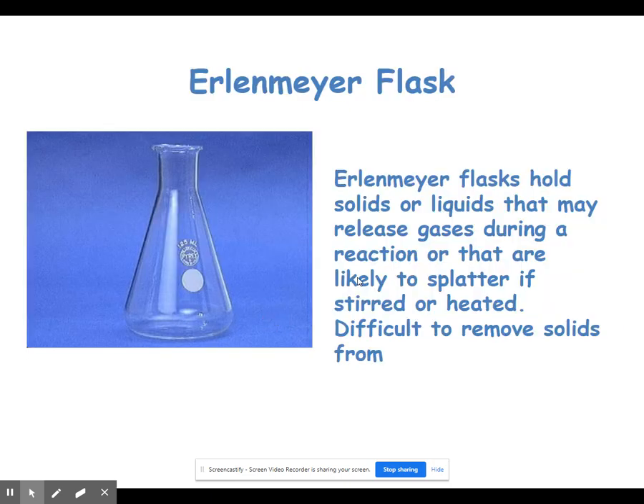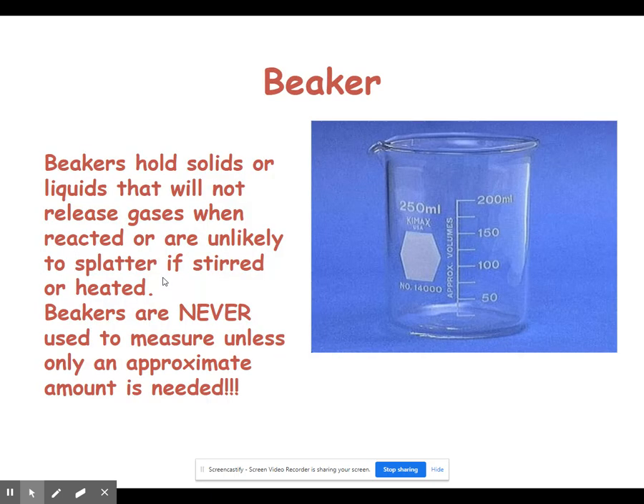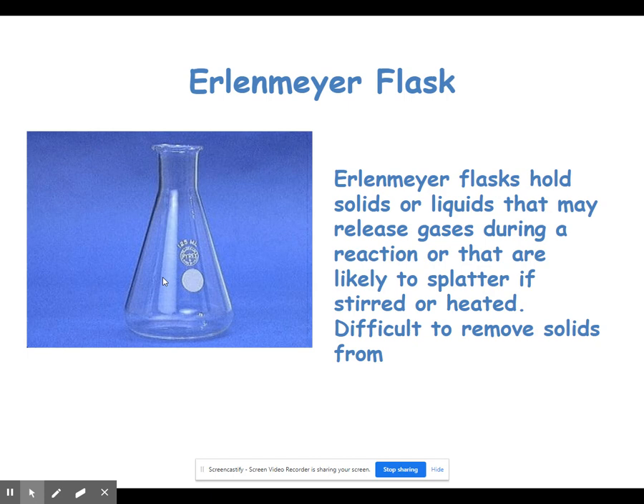If we have things that might splatter or release a gas when heated or stirred, we'll use what's known as an Erlenmeyer flask. An Erlenmeyer flask has a lot of the same uses as a beaker — it just has a very narrow neck at the top that prevents things from splattering out. One thing to note is it's very difficult to get a solid out of this flask because the neck is so skinny. Erlenmeyer flasks do have volumetric labels on them, but just like the beaker, we don't want to measure things in them unless we're only looking for an approximate measurement. Beakers and Erlenmeyer flasks come in a wide variety of sizes, from a couple of milliliters up through several liters.